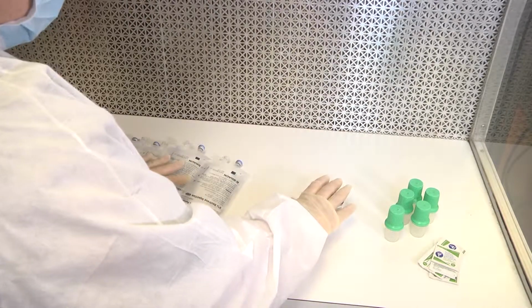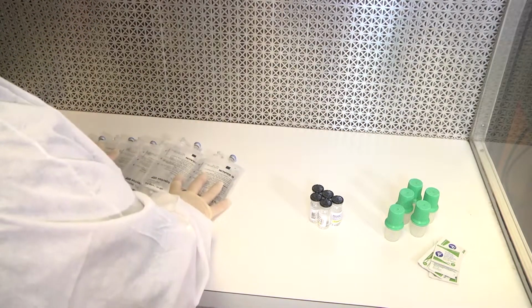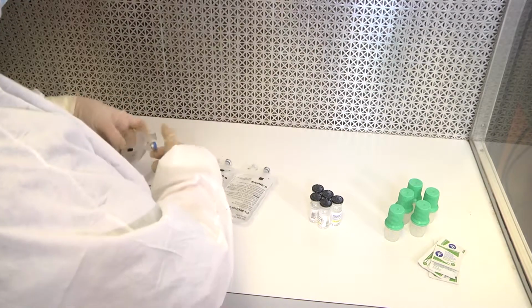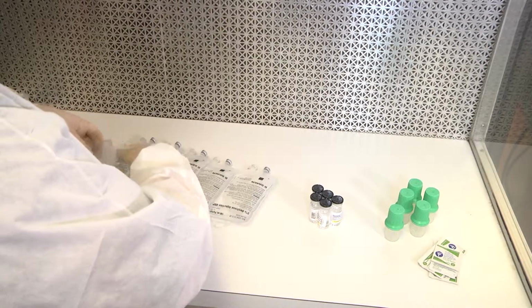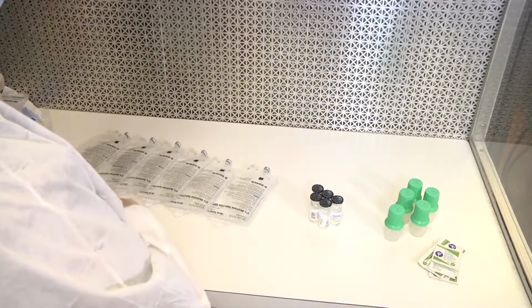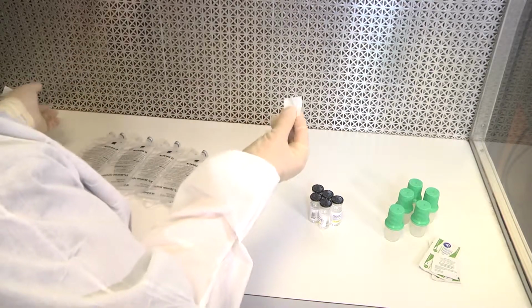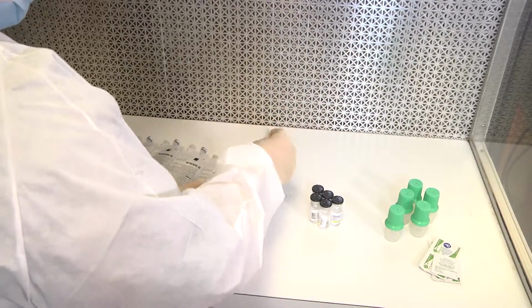So then I have my antibiotics, and then I have my Add-Ease containers. So the first thing I'm going to do is open all the tops of the IV bags, keeping them faced toward the HEPA filter. And next, very important, you have to clean all of the ports where the Add-Ease is going to insert. So I usually use one IV swab per 2 bags.